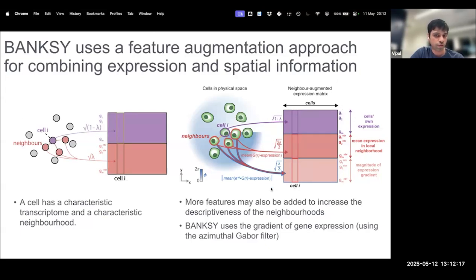You still just have a feature object or gene cell matrix, which you had originally in traditional single cell data analysis. So an implication of this is that all of the traditional single cell analysis packages that exist out there can still analyze your spatially informed data structure, right? You've not created some totally different framework like HMRFs. And so we'll see towards the end of the talk that, in addition to domain segmentation and cell typing, there's really no reason why you can't do other things. For example, we used this feature object matrix to do spatially informed batch correction, and that was better than non-spatial batch correction, and so on.